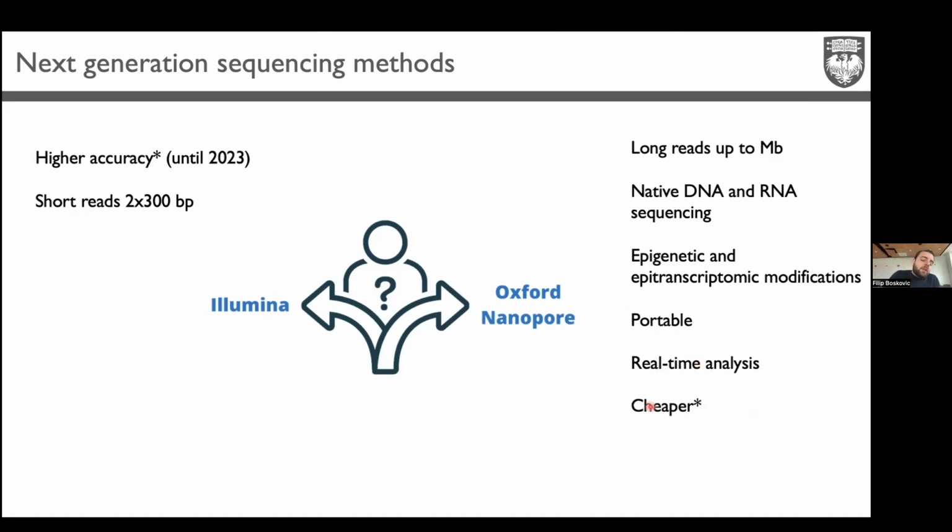And actually, Oxford Nanopore, this whole thing, so if you buy the MinION and the flow cells, it costs maybe 2K. And depending on your sample, you can maybe get even $10, $20. So people who are usually doing plasmid sequencing offsite, so you send your sample to a company, actually they do Oxford Nanopore sequencing, because you can get for $10 the sequence of your plasmid way faster and easier than with Illumina.